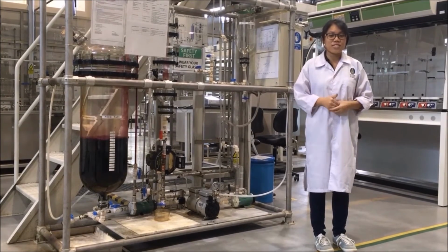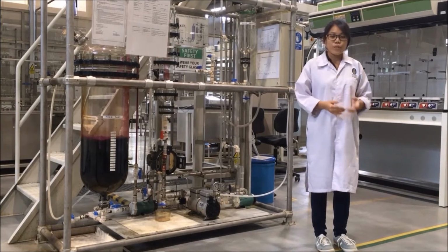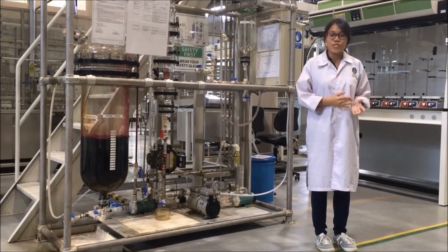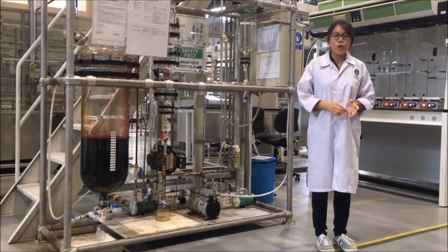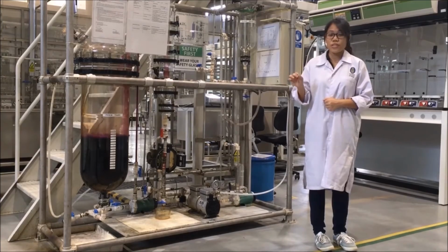The concentrate and condensate we obtain in these experiments is actually in water vapor form, which means they both have the same refractive index, which is 1.33297. That is why the concentration of concentrate and condensate shows a straight line in the concentration graph, because the concentration of water is the same.